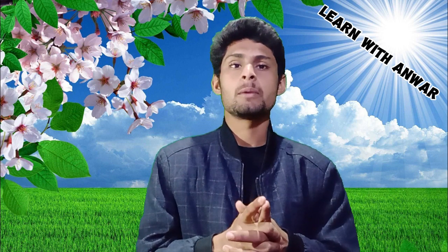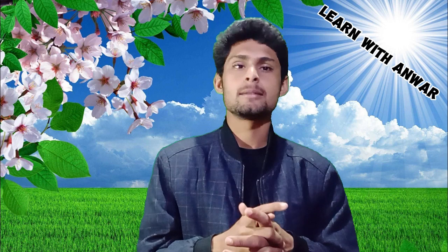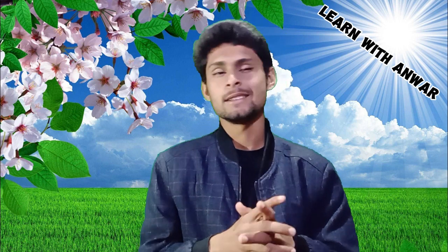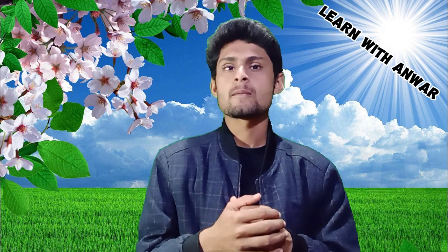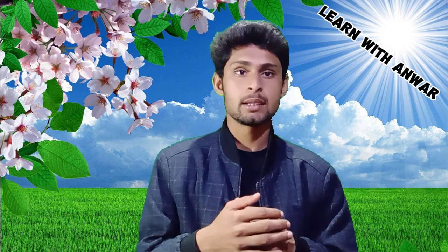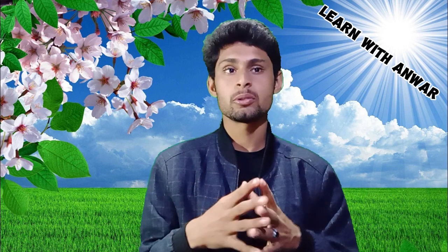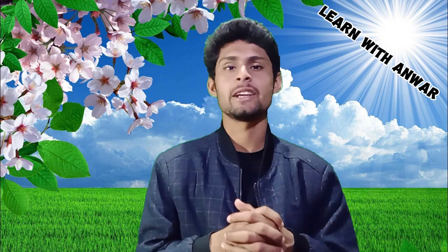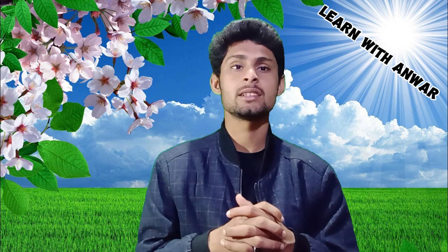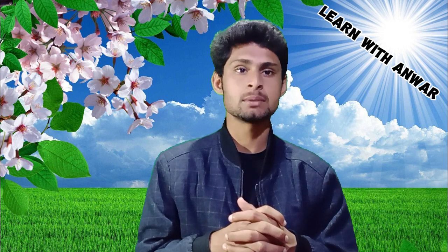The most familiar type of microscope is the optical or light microscope, in which glass lenses are used to form the image. Optical microscopes can be simple, consisting of a single lens, or compound, consisting of several optical components in line. A hand magnifying glass can magnify about 3 to 20 times.